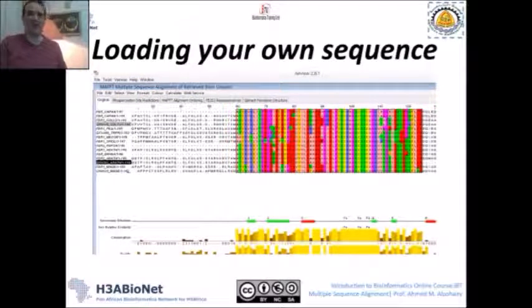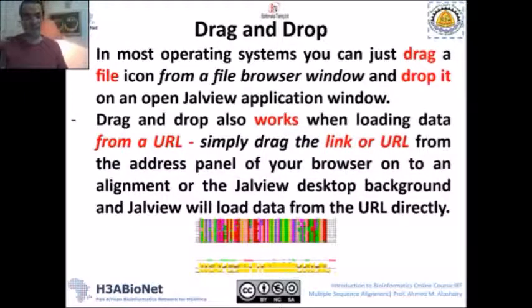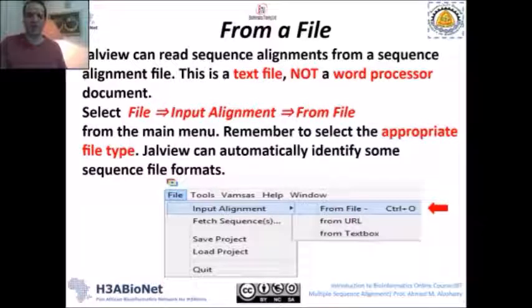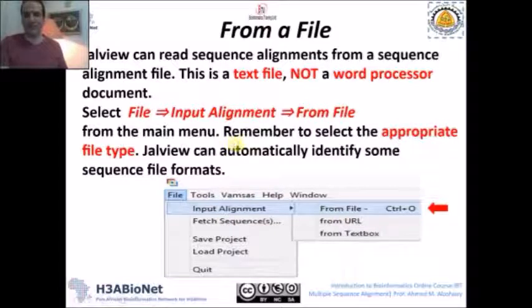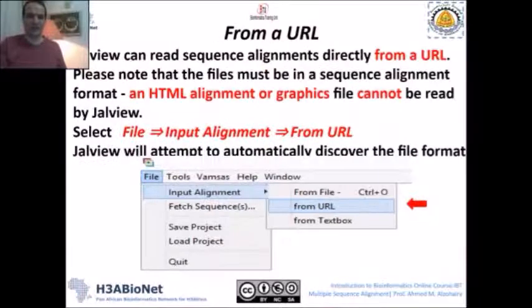Now we come to the important part: how to load your sequences. As mentioned in the last lecture, you have many options — drag and drop, from file, from URL, cut and paste, or from a public dataset. For drag and drop, you simply drag your sequence file and drop it into the program. For loading from file, go to File, then Input Alignment, then From File, and select your file, which should be in FASTA format as a plain text file.